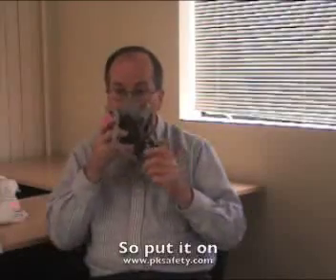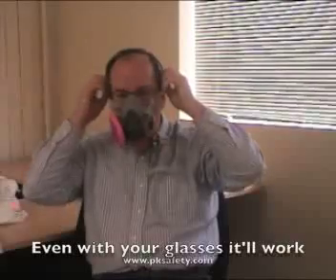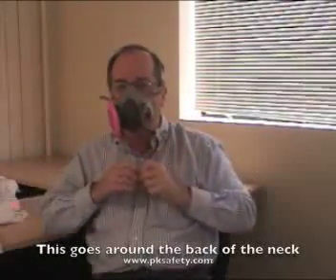I'll just put on one for now. The mask then goes on your face with your chin right in the bottom of the cup here. It goes over the top — even with your glasses, it'll work. Then tighten it up. This one goes around the back of your neck, like so.